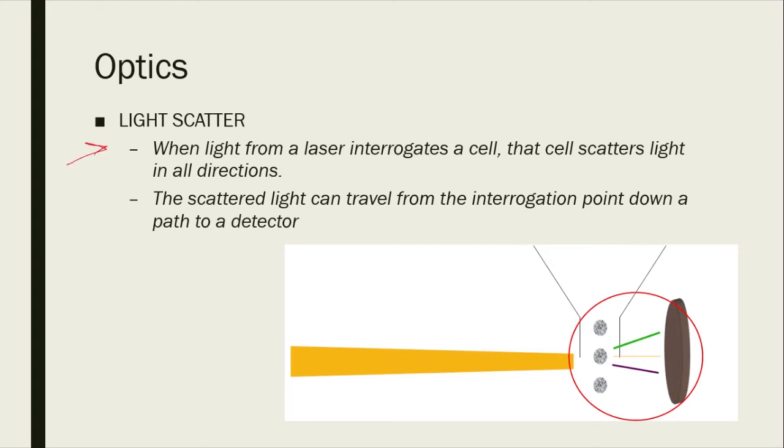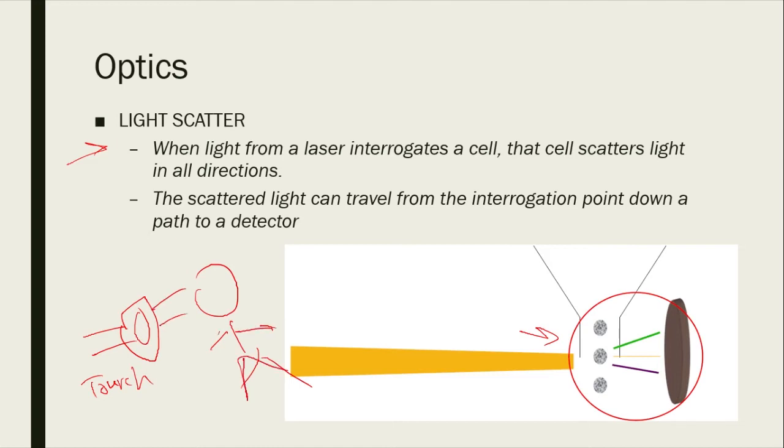In terms of the optics, we are talking about light scattering. There is a laser beam being beamed into each individual cell, as shown in the figure here, and the light will be scattered in different directions, right? So the idea here is you have a torch. That's a very bad drawing. T-O-R-C-H, a torch, and you have a stick figure here, a stick human, and you shine the light, and the light will be blocked and scattered by the person, right?